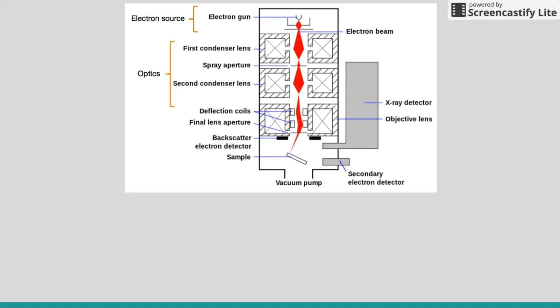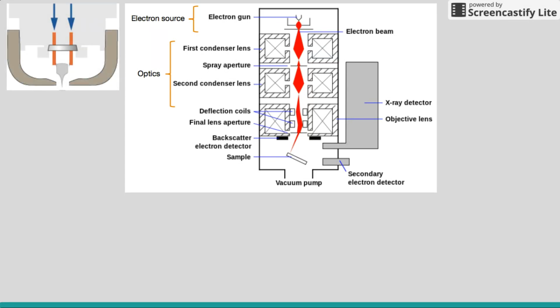Here, we'll discuss the components of an SEM and how those components work and interact with the sample. Let's start with the electron gun. SEMs use either a thermionic emission gun or a field emission gun. Since the SEM used in this investigation has a field emission gun, we will not detail the operation behind the thermionic emission gun. By applying an electric field to the tungsten crystal, a very bright beam of electrons is generated and emitted from the tip of the crystal through a tunneling effect.